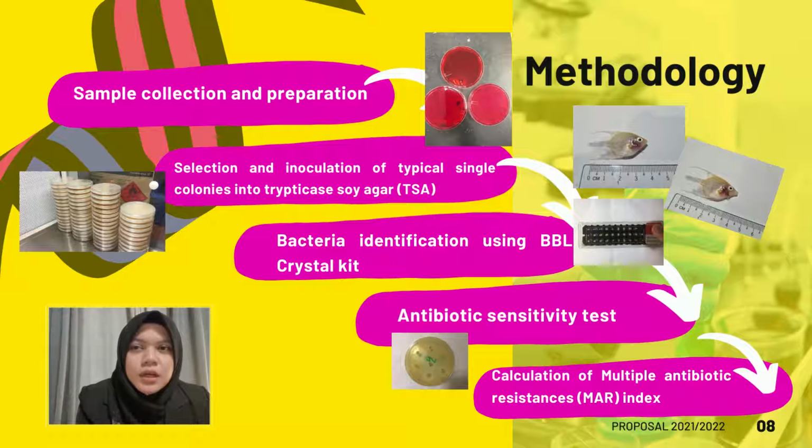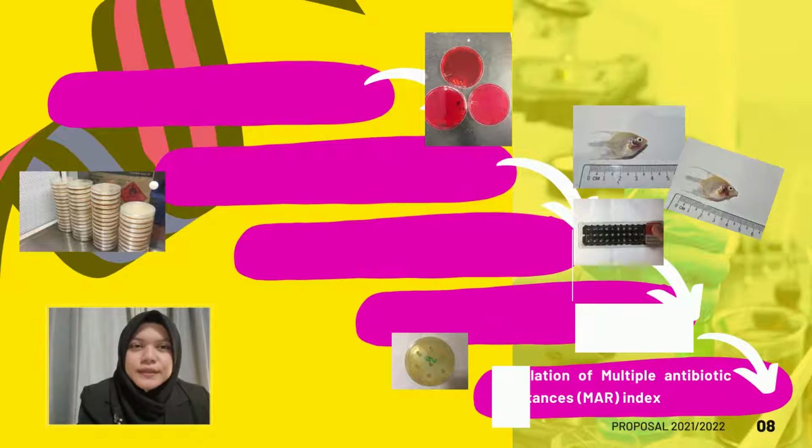After swabbing a sterile cotton bud on the TSA agar plate, the Kirby-Bauer disk diffusion method was used to evaluate resistance to antibiotics. Each antibiotic disc was analyzed and converted into sensitive, intermediate sensitive, and resistant. The antibiotic resistance index was calculated then.